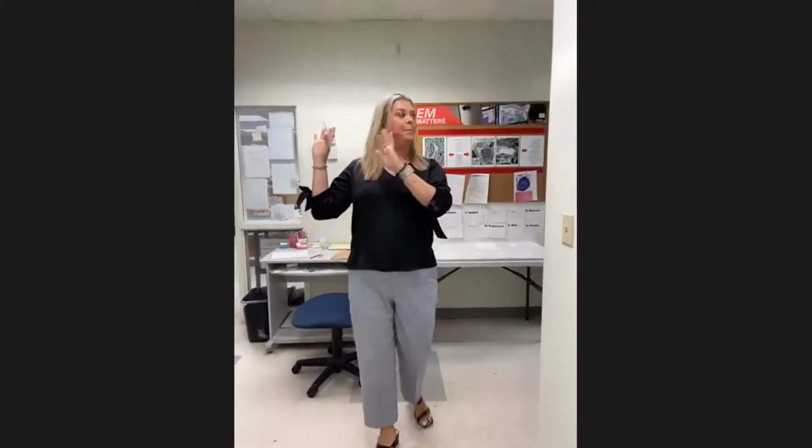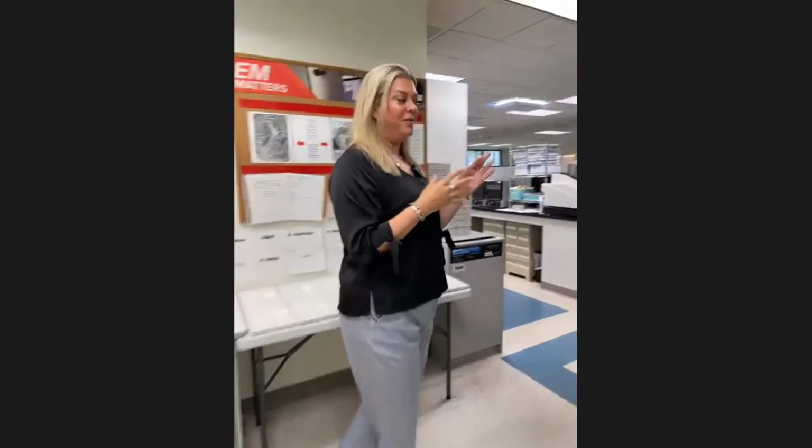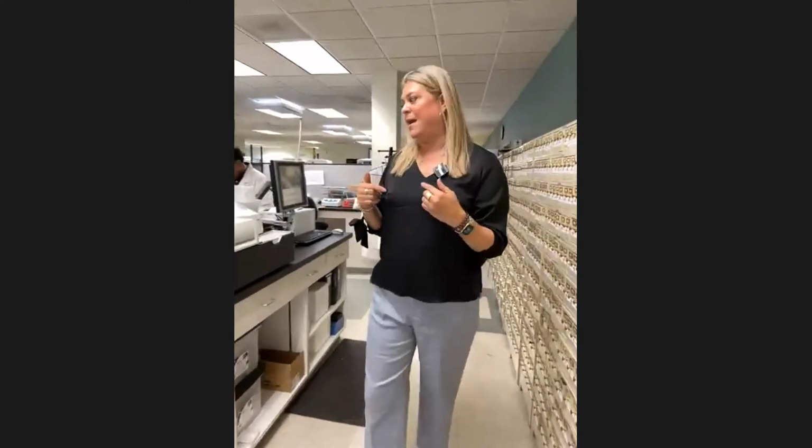So, all right, that's it. That's pretty much it for how a piece of tissue comes out of the patient and turns into a slide. We take pictures of those things that you just looked at in the EM, and the physicians will put those pictures as well as the slides that they cut for light and IF and marry all that up together and arrive at a diagnosis. So that's it. I am going to throw it back to you, Dr. Larsen.